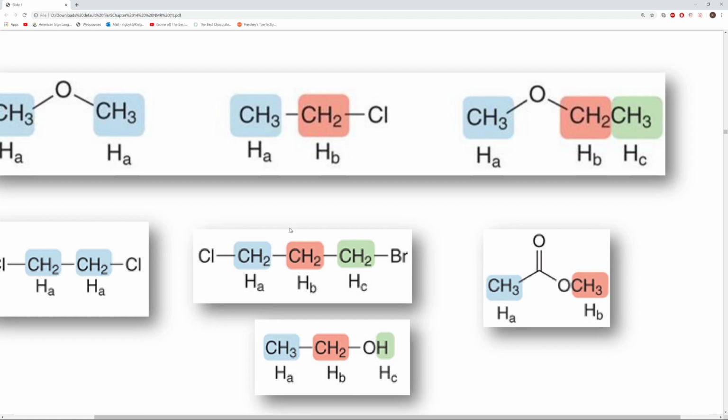That's something important to look out for because that's something that I see a lot of people messing up on, when they see a carbon that doesn't have any hydrogen bonds because we're looking at the line angle structure. And remember, we don't normally draw the actual hydrogens on the line angle structure. So if we see a carbon with 4 bonds and you just forget to count those bonds, you might be inclined to count that as a different type of hydrogen. You just have to look out because not all carbons are going to have hydrogens attached to them.